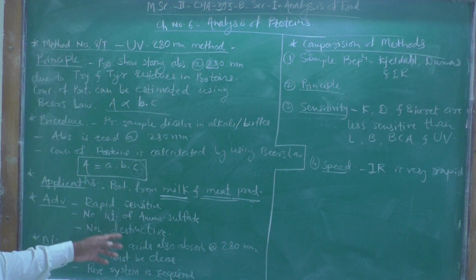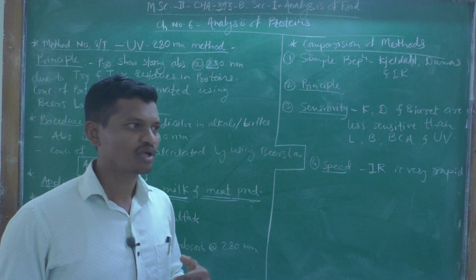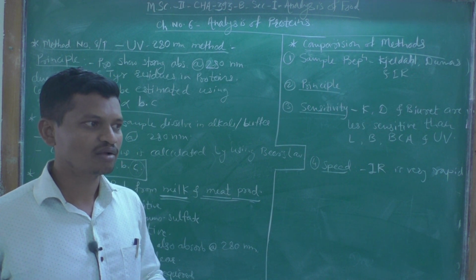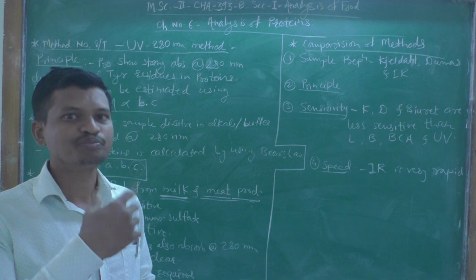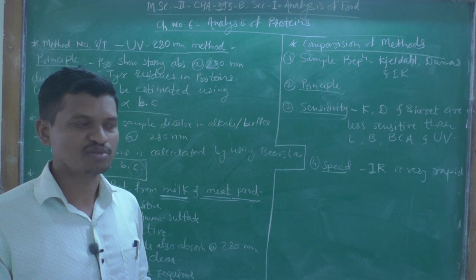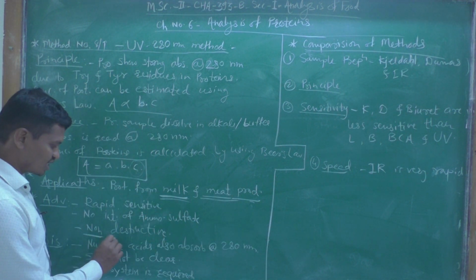Then this method is non-destructive. Non-destructive in the sense that we already studied the Kjeldahl method and Dumas method. In both of these methods we utilize the protein sample and convert it into other forms of nitrogen. So those methods are destructive ones, but this UV method is non-destructive.